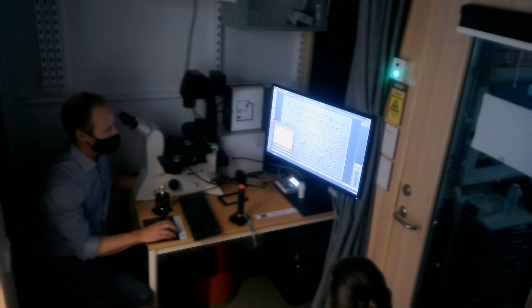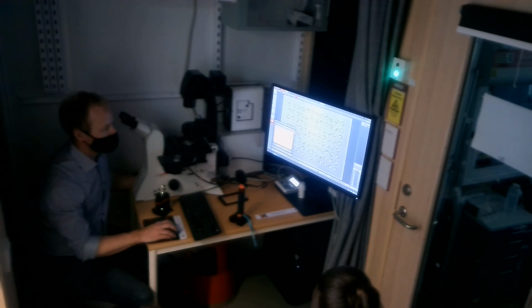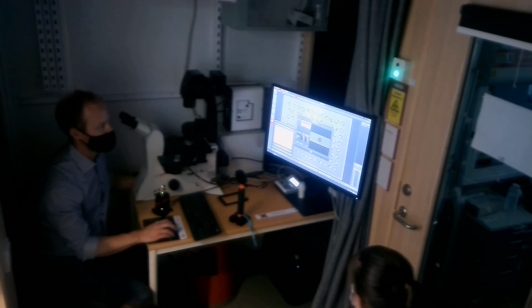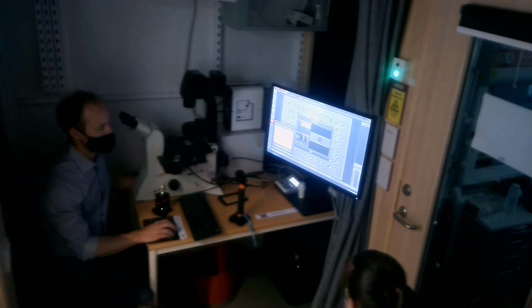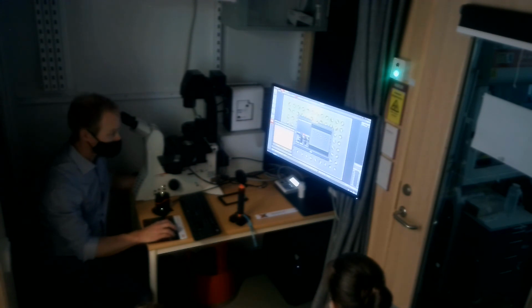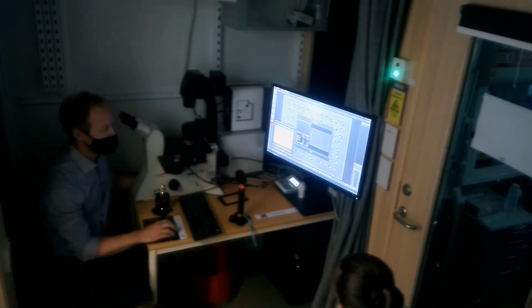So, if you have another one, you go into here, edit custom carriers. So I click on this, and in here now you can choose what type of carrier type. So you can add a slide or anything, but we go into well plate. In here you would say my chamber shape is round. Number of chambers, 12 by 8. Let's go with that. The carrier size, horizontal, vertical, chamber size, chamber distance, and offset.